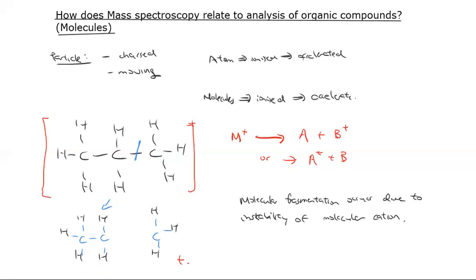So whenever you're doing a mass spec, you get a readout, and that readout would include potentially the whole molecule minus an electron. Most certainly could have that, and probably will have that, because you have to remember, you're not putting in one molecule, you're putting in a sample which is lots and lots of molecules. And so some of them will break up, or in fact, most of them will break up, but there will still be a decent number that make it there without breaking up just by sheer numbers. So you'll get that, but you'll also get the ones that break up.